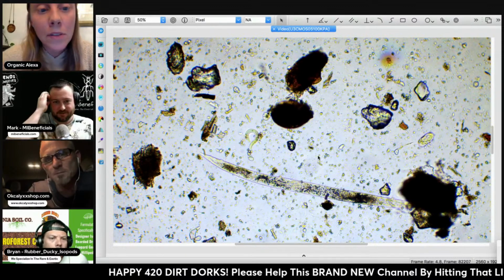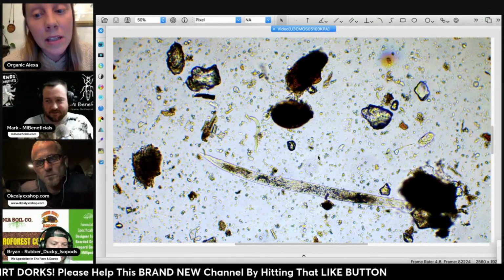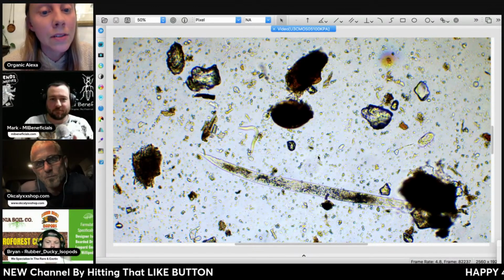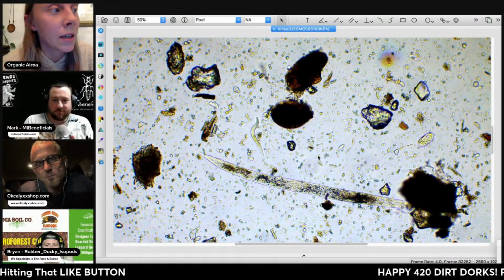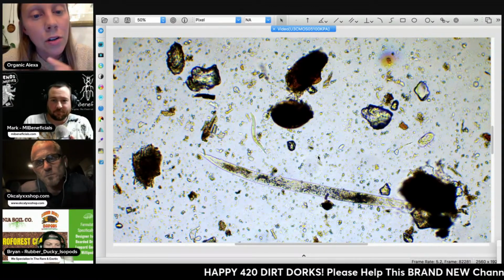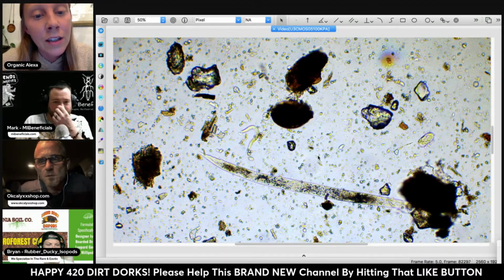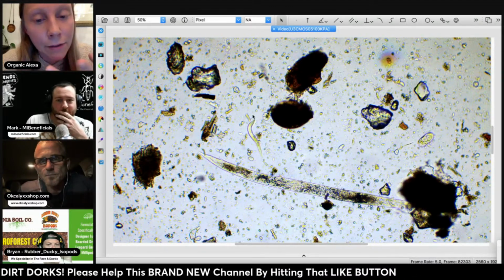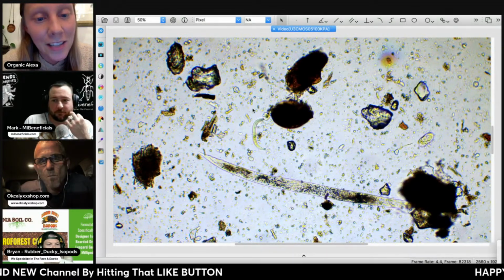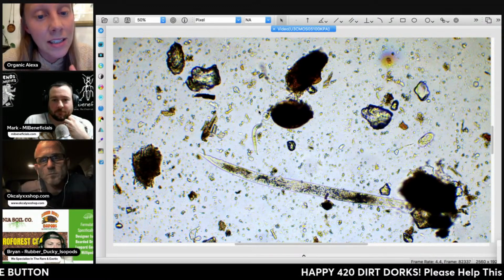Yep. So like I said, it's really amazing because when I received the sample, it was dry and there were still live nematodes in there. Nematodes have a dormant form called cryptobiosis, and they basically just slow down their metabolism enough and stop moving. So you can tell I have an eye for it because I look at the predatory nematodes we get at the grow all the time, which ones are actually dead and which ones are just in a dormant state.